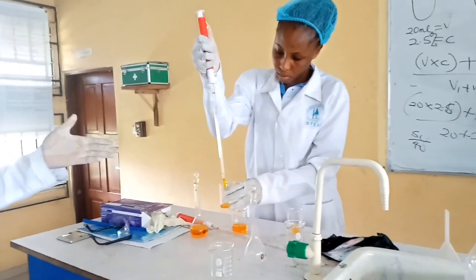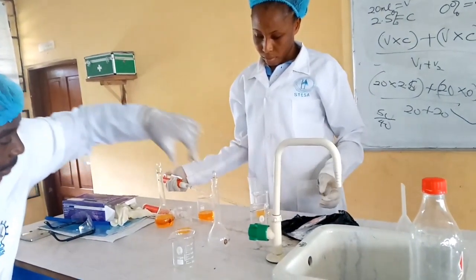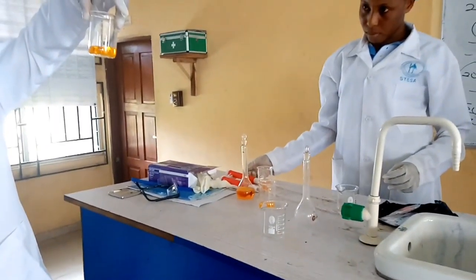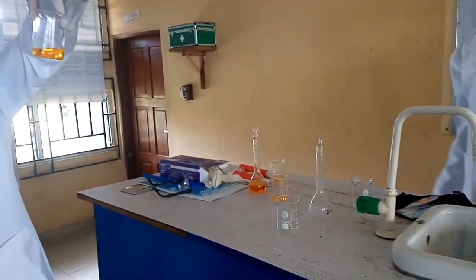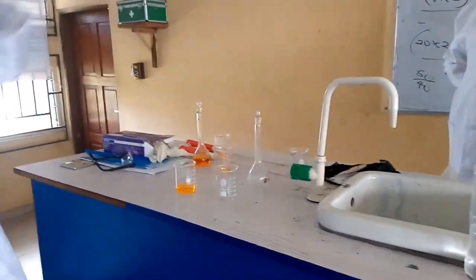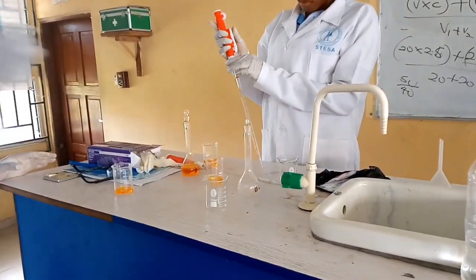So that's 10 mil. Now she's not putting water. She's putting this other one. What's the concentration of this one? 1.25. Is it not? She's taking 10 mils from here and putting into that one. So take 10 mils from here. This is your new solution. You have to take 10 mils and put here.